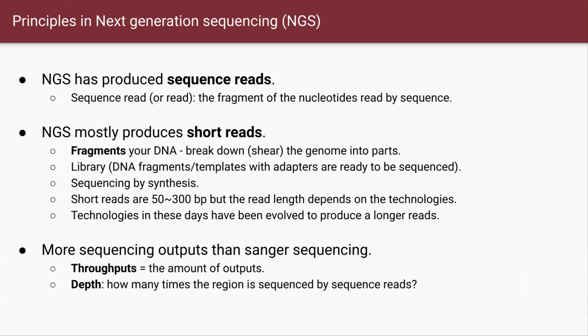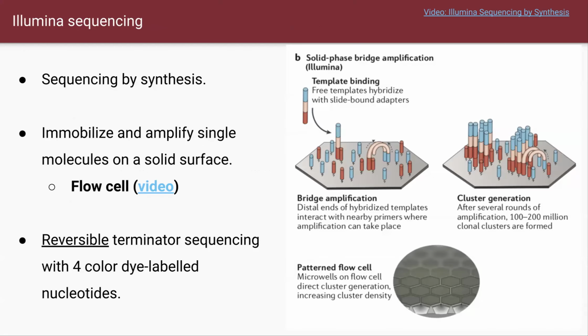And you get a coverage, right? So you get 3 billion base pairs of your entire DNA sequence, and some of the area is not easy to sequence, right? Because regions around centromeres or telomeres have very complicated sequence information. So those regions are not really covered well. So coverage is literally how much of the regions you really covered by your sequencing experiment, right? So the ideal situation is 100% coverage, you cover everything, but in real life it is not, right? So this is one of the aspects you have to consider in next generation sequencing.